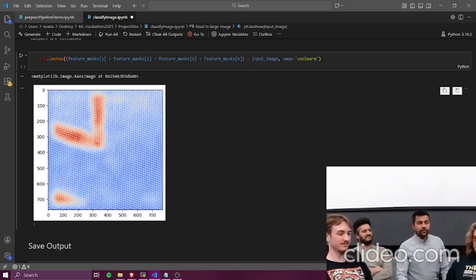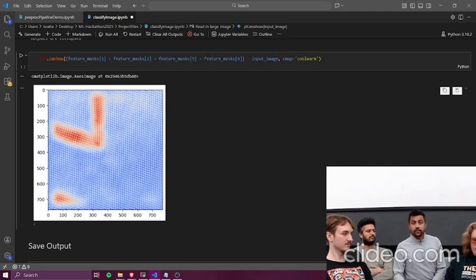The data we have with STO was highly crystalline, with no defects in it, and obviously it won't be showing defects in the image. But we tried this trained model with another image we have from STO, which was defect-rich, and it worked well on that. That means it's working well for the STO.